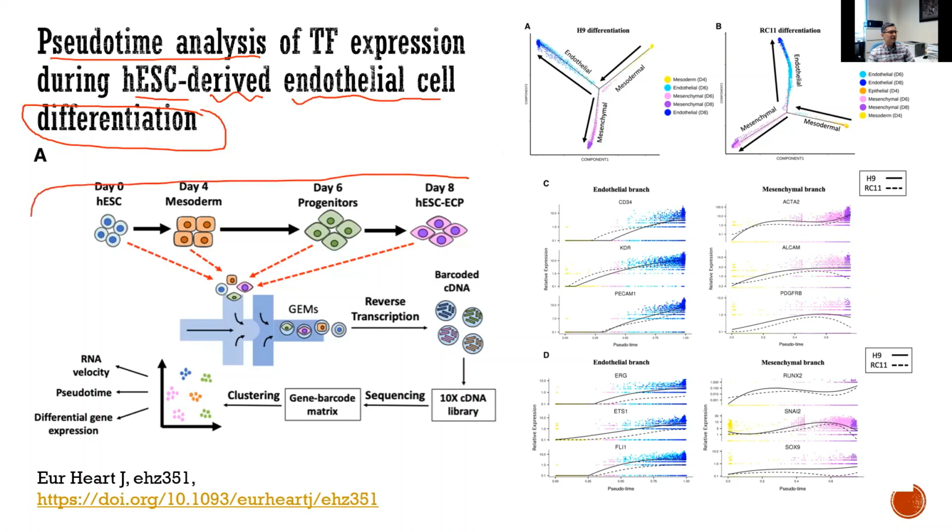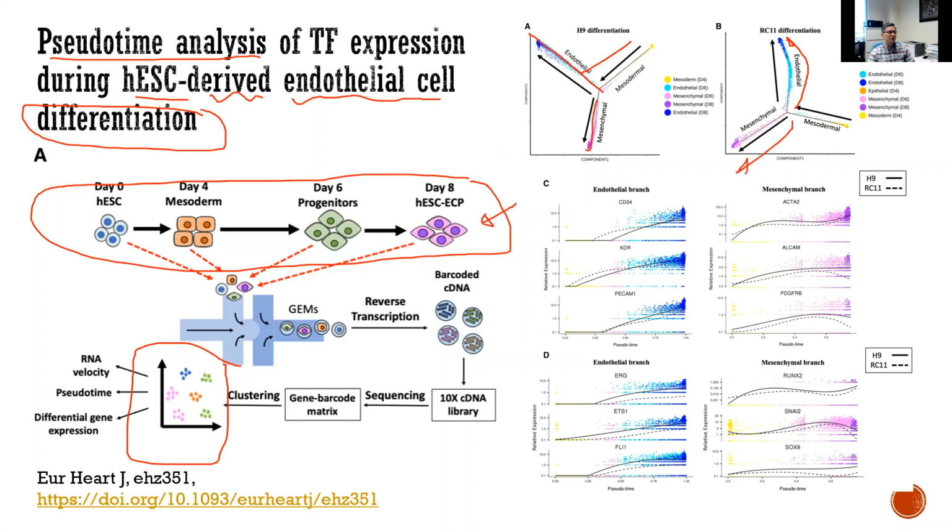Their sample has different combinations from a stem cell to progeny and to more differentiated stages of cells, put together and sequenced using 10x Genomics, and then clustering and reconstructing these trajectories, to study which genes may be associated with and regulate these three different processes, because they reconstructed three trajectories, 1, 2, 3, to different directions.